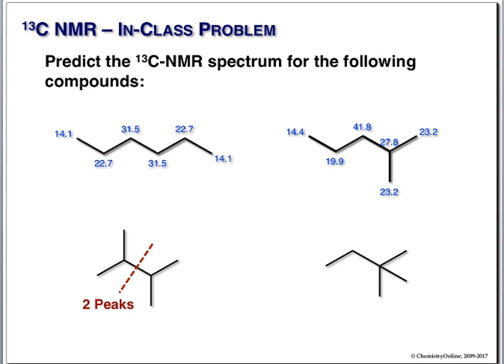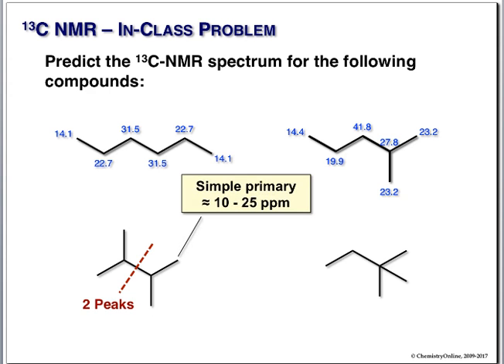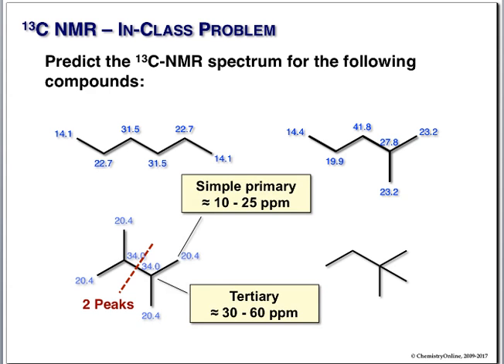All right. These methyl groups on the end are going to be simple. Going to be a real crowded molecule, so it's going to be a little higher than the simple methyl group. And we have these guys, which are tertiary. Our simple, we expect it down at the bottom. Our tertiary is going to be higher. In fact, we have 20s and 34 for our tertiary carbon.